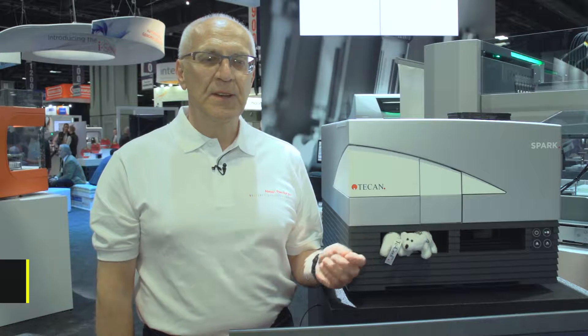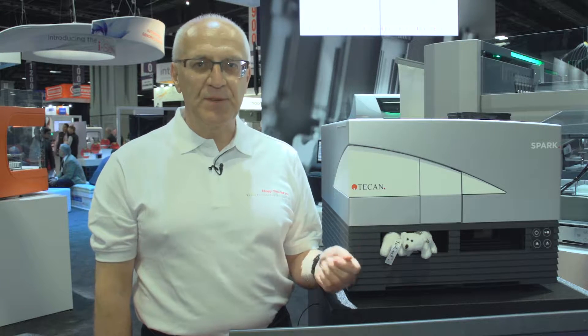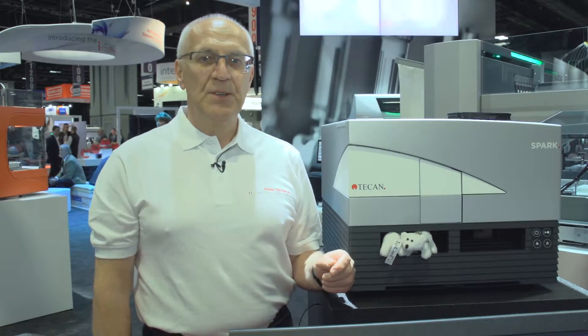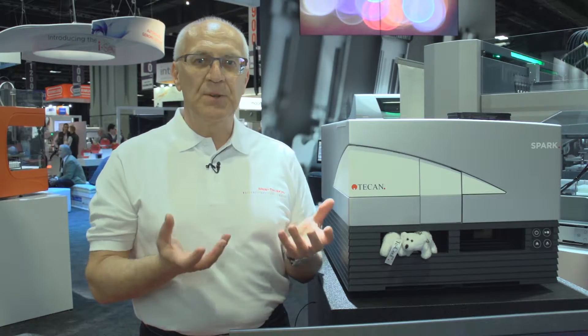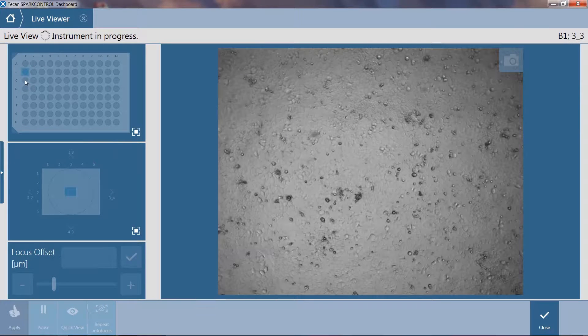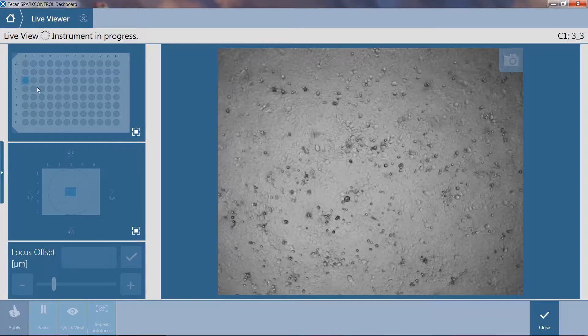Hi, my name is Michael Feitel. I'm delighted to be here at the SLS Show 2017 to introduce two exciting features of our newest Spark multimode microplate reader. This is the live viewer for automated microscopy as well as smart automation, and I will basically tell you what smart automation is actually all about.